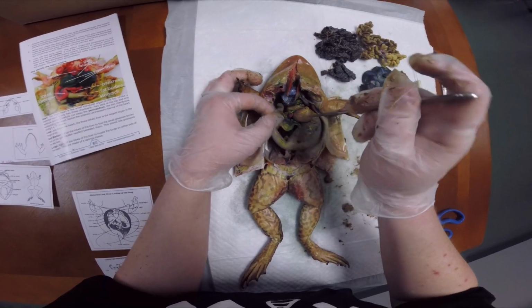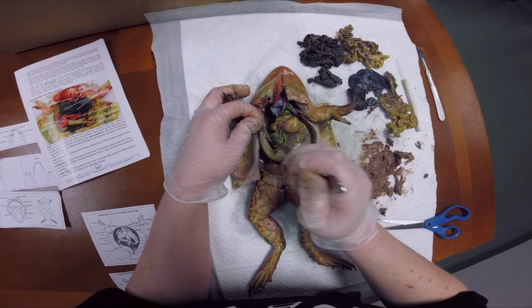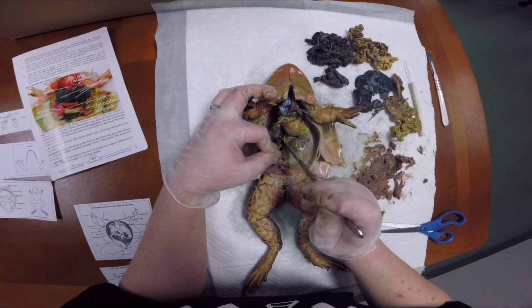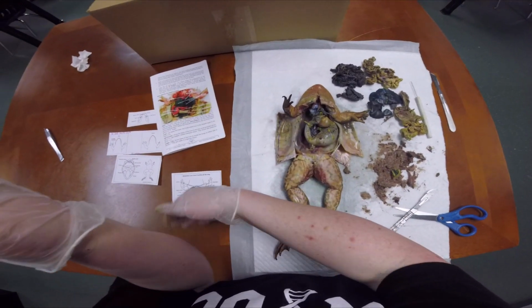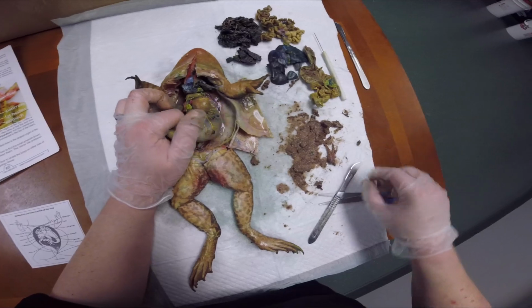One time last year we opened up a frog stomach, and we found a snake, and we tried to identify it, but it was a little bit too far gone. And then 2 years ago we found a bird in the stomach. So you can see these guys will kind of eat anything.